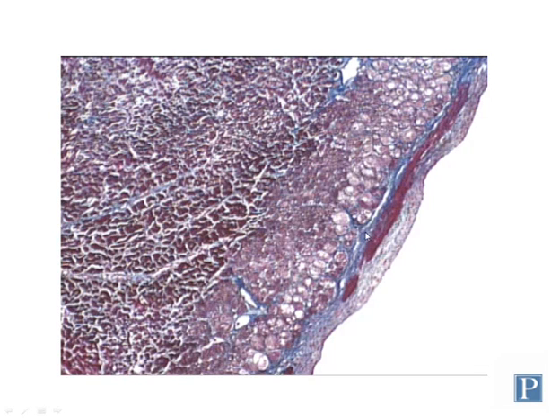Deep to the subendothelium, you have this layer here, which is often referred to as the subendocardium. Although it's called subendocardium, and it may make you think that it's beneath the endocardium, it's actually considered to be part of the endocardium, but it is the deepest portion of the endocardium. And this layer is composed primarily of Purkinje muscle fibers as well as connective tissue.